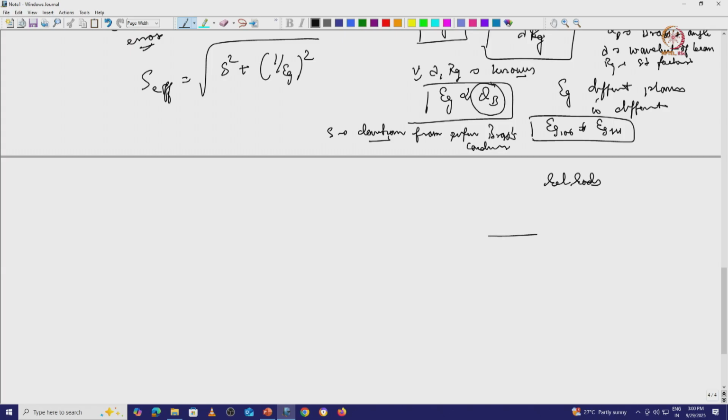And when your sample is present here, if you have some crystallographic planes, if your beam is interacting and it is forming certain spots, these spots, because of the thickness, Z thickness, are few unit cells, then what will happen? The intensity along the Z will get broadened. So you will see the rel rods.